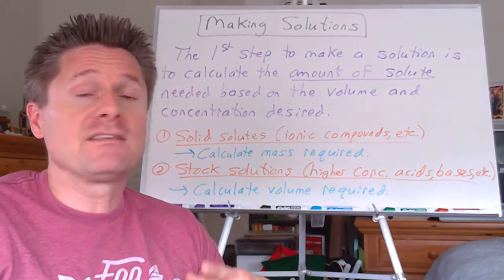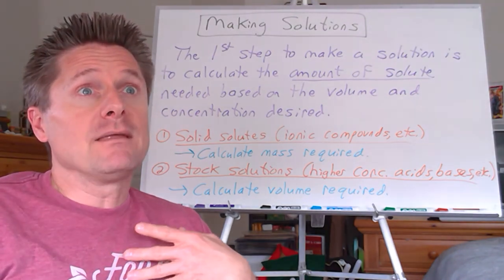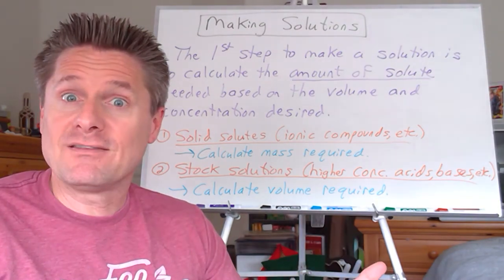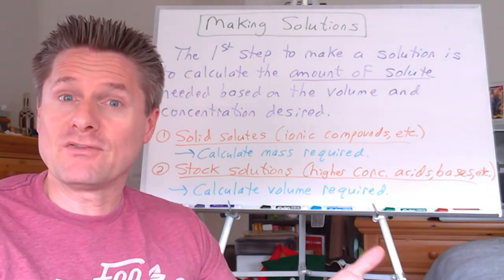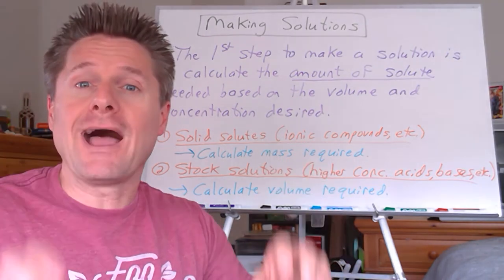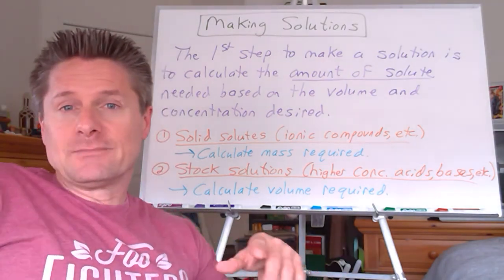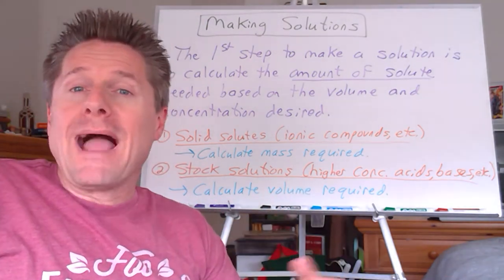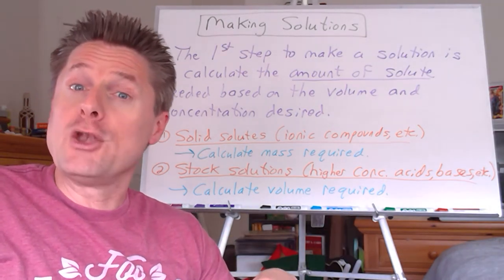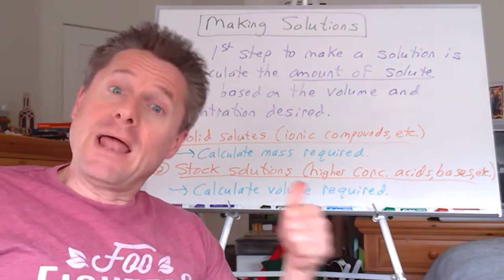Or maybe it's an unknown we provide for you and we know the value. But say it's an acid or something, and then you need to titrate it with a base, but you don't have a base to titrate it with. So you have to make your own solution. And you want to standardize it, know its concentration, usually to four significant digits, or prepare a back titrate solution. There's a whole different set of situations where you're going to be using solutions, and you want to know the concentration quite accurately. But how do you make those?